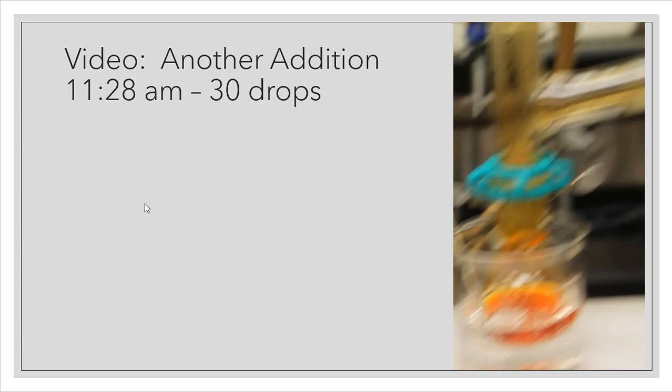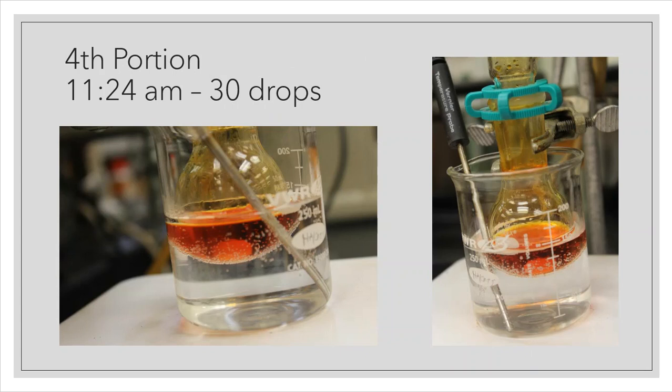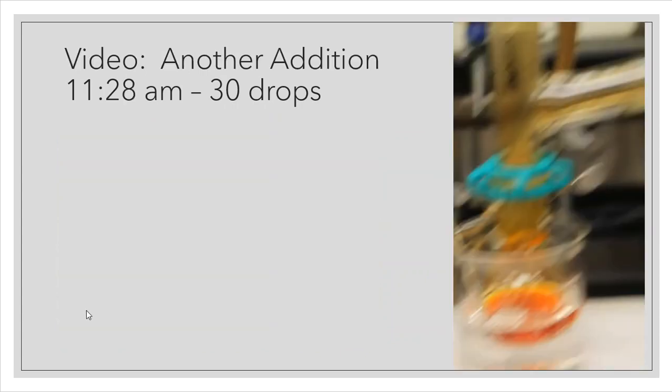One of the reasons I was using only 30 drops and not 40, which is perfectly okay, the lab directions told me that I could do that. So 11:28, I get another portion, and that was another 30 drops. All right, so 11:22, and then 11:24, and then 11:28. That shows you how quick that this process was happening.